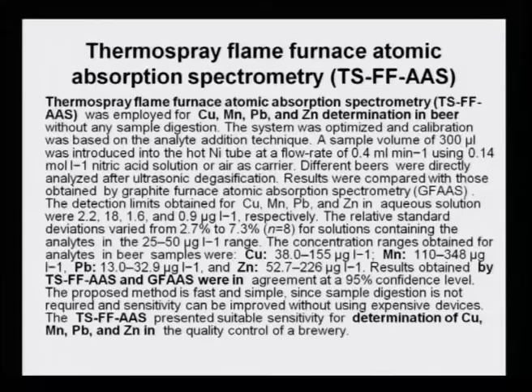The TSFF-AAS, thermospray flame furnace atomic absorption spectrometry, was employed for copper, manganese, lead and zinc determination in beer without any sample digestion. Now, this is a unique case where the beer sample was not digested, but directly analyzed.